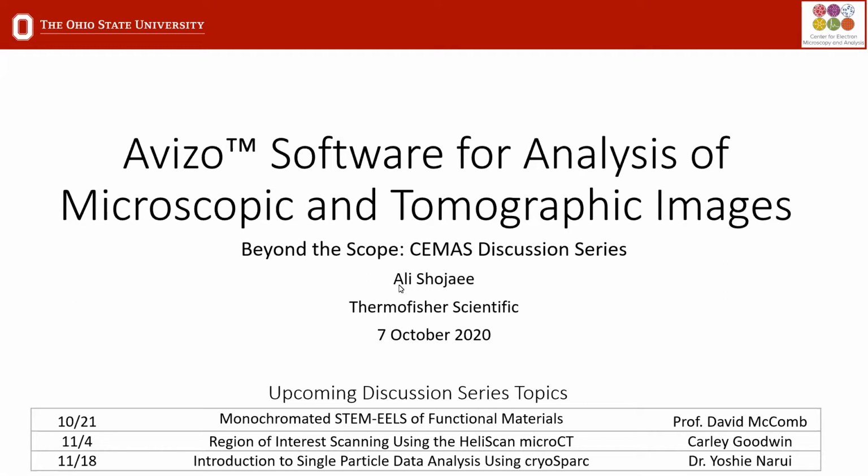Then we'll be going to Carly Goodwin, who will be talking about the Helioscan Micro CT, which ends up using quite a bit of the Avizo software that'll be discussed today. And then we'll finish up the semester going to Cryo-EM with Yoshi talking about how to do some data processing using CryoSPARC software for single particle analysis.